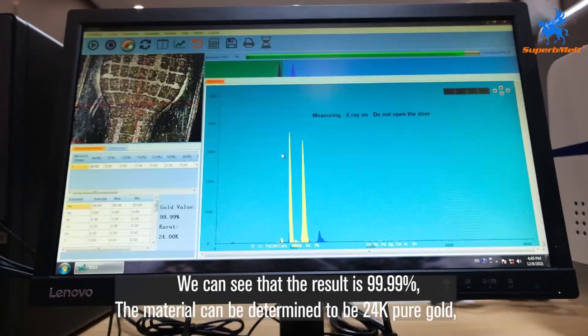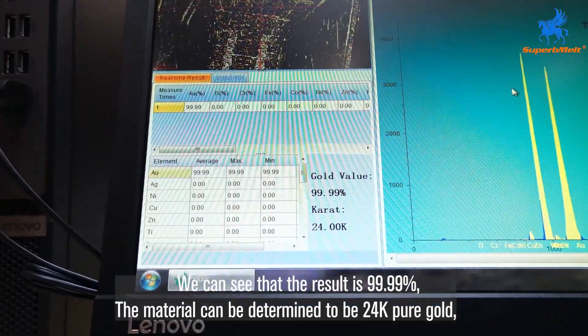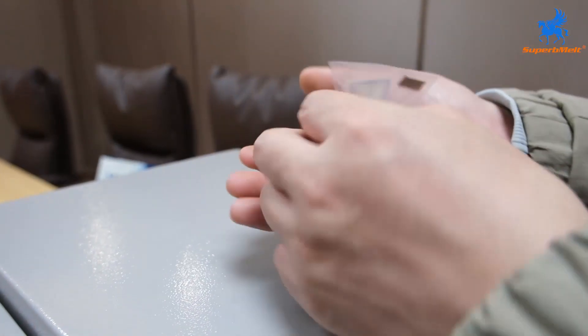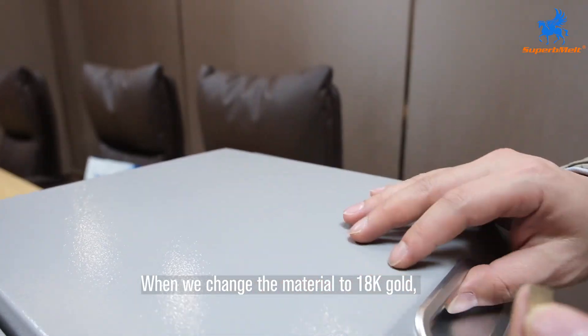We can see that the result is 99.99%. The material can be determined to be 24k pure gold. When we change the material to 18k gold.